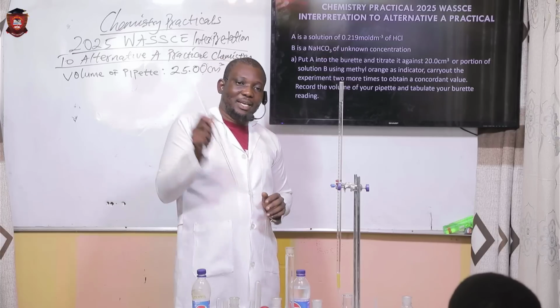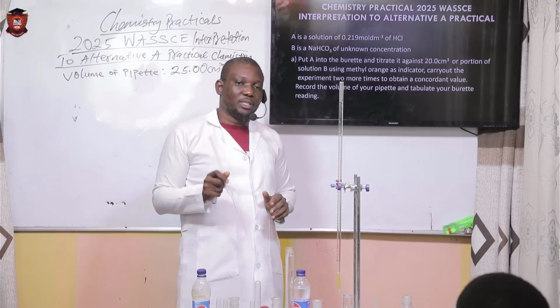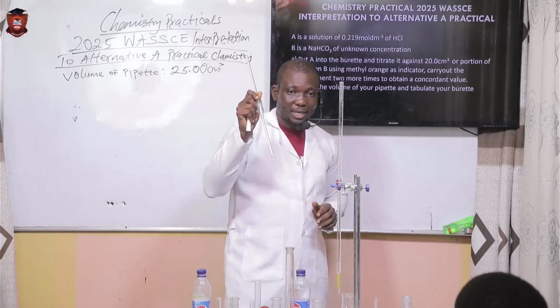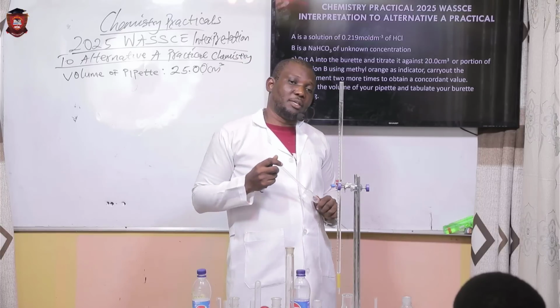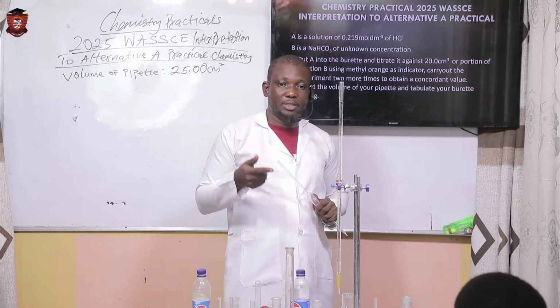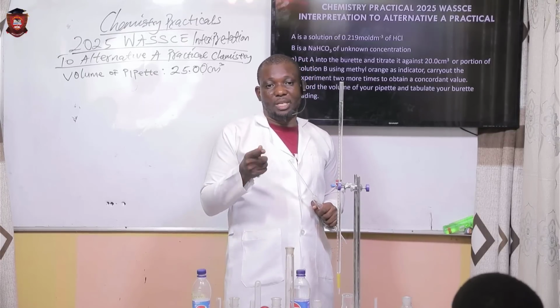So as a candidate in a particular center, you must state it so that it will conform with that teacher's recorded pipette size. It is very important.